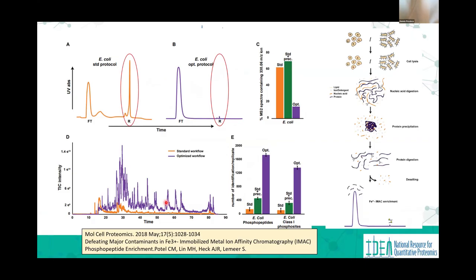There are, I don't know, hundreds, thousands of papers that people go through, and they have their protocol for enrichment. And one of the real difficulties was, one lab could have a protocol and it worked great, and you try to repeat it, and in your hands, it just didn't work. Like, you could tweak the differences, and my lab finds that we need a lot more of the chelating compound. We have to use a lot less lysate, or we have to use a lot more lysate, or we have to rinse it in a different buffer.